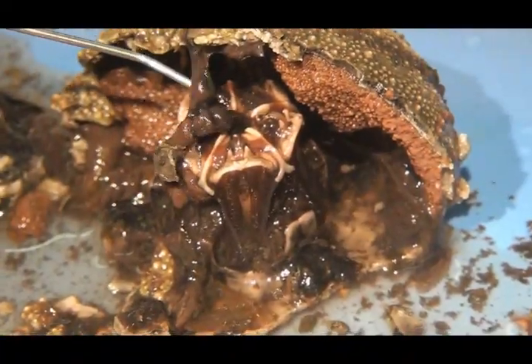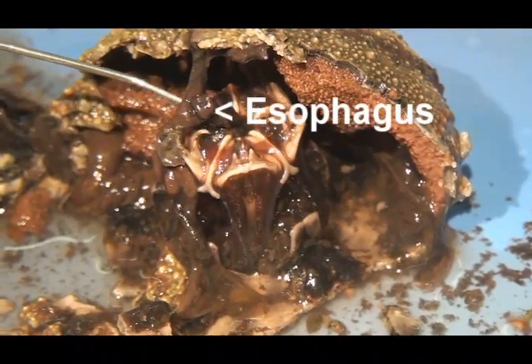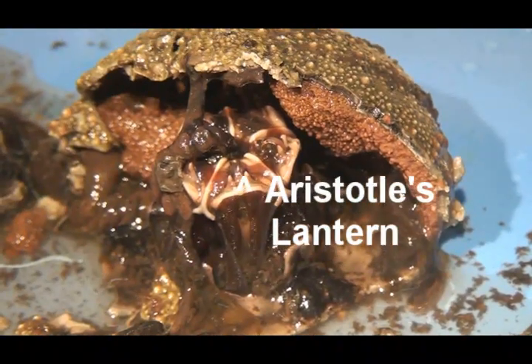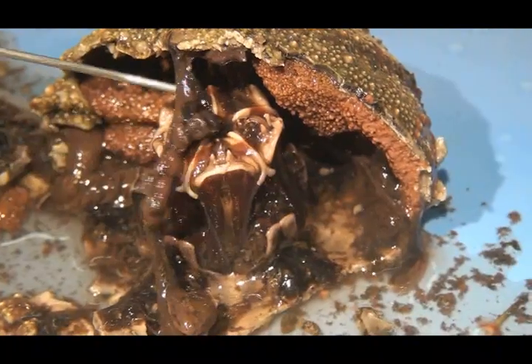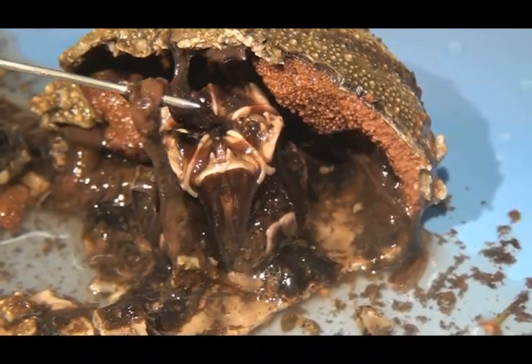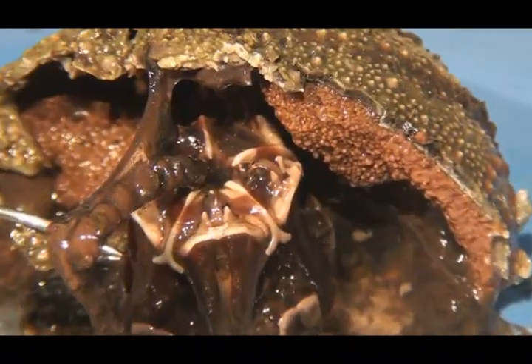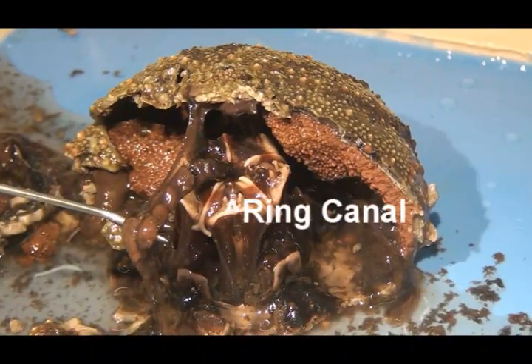Here we can see the esophagus. The esophagus goes into that large structure called Aristotle's lantern. If you follow the esophagus into the lantern, it becomes a pharynx. The reddish-brown ring surrounding the top of the lantern is known as a ring canal.